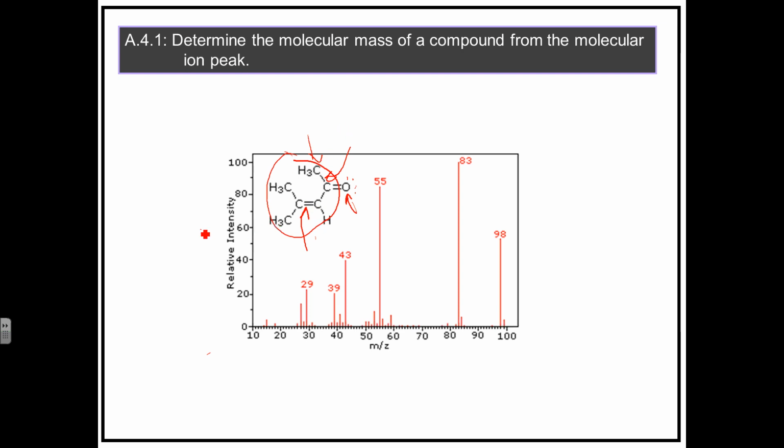So let's pretend that an electron hit there. Okay, and so therefore electron bombardment breaks that bond. Now it's quite possible then that if that happens, and let's just remind ourselves of what a bond is.